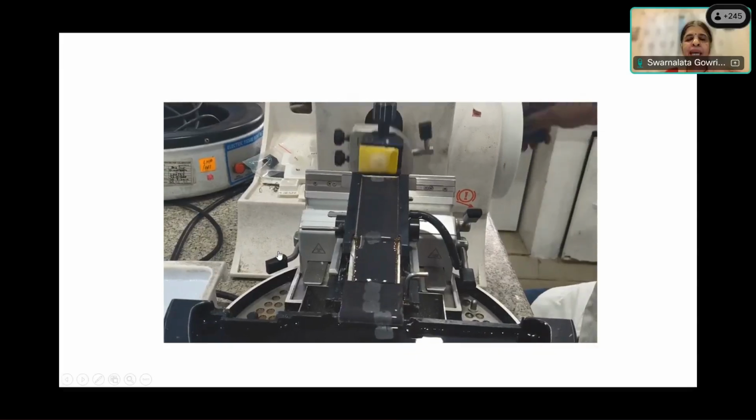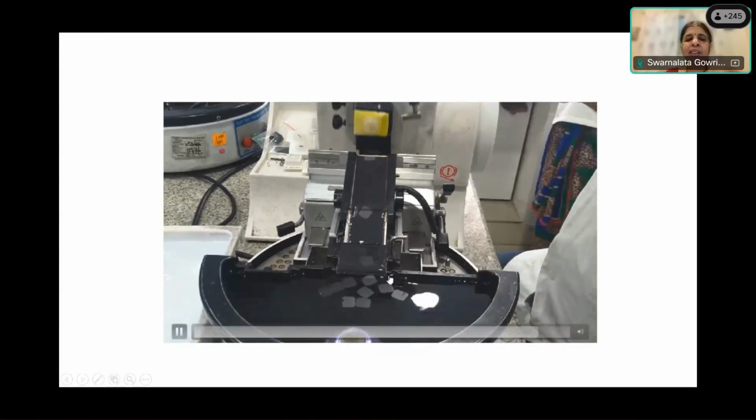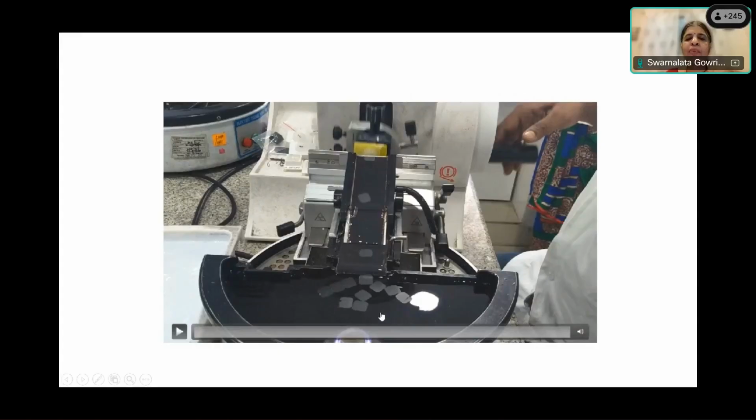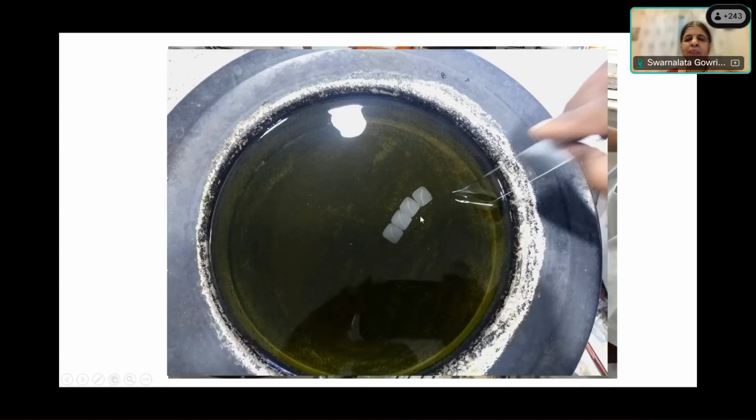And here is how we actually, this is a microtome where you get serial sections and the tissue is floated on to a water bath directly. Alternately, you can pick up the section and then float it on the water bath. So this is where you have a slide-like thing with water flowing on it, but you can have regular microtomes where you float it on the water bath over here. And here you adjust the temperature so that the wax just melts, and this is how you get the serial sections, and then you lift the serial sections with your glass slide.